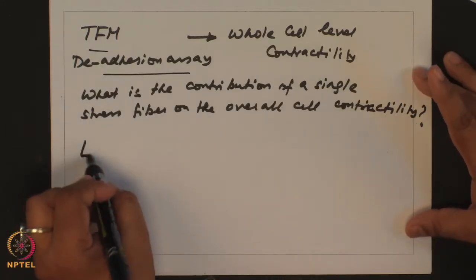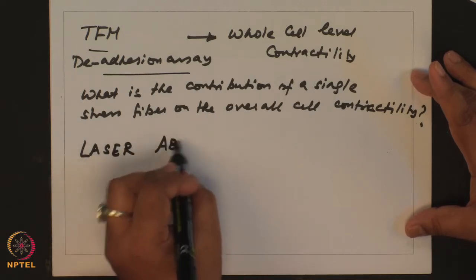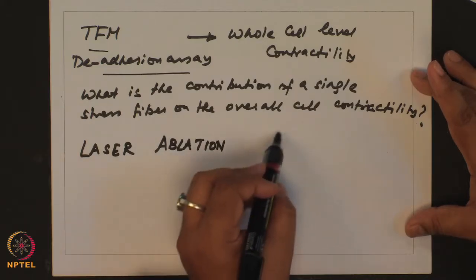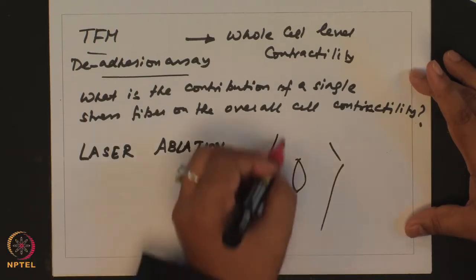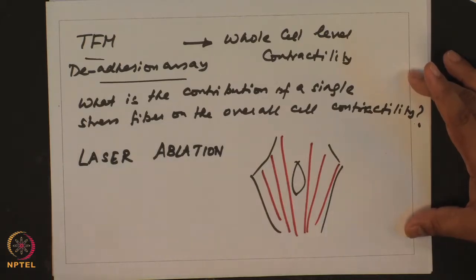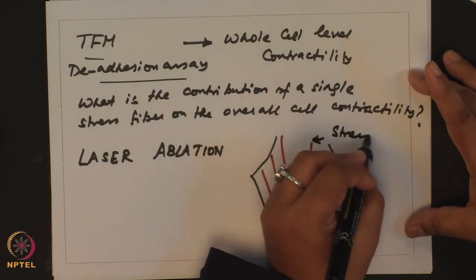So, there is a new technique which has been introduced, called laser ablation. Imagine you have a cell transfected with LifeAct, and you can have very prominent stress fibers.